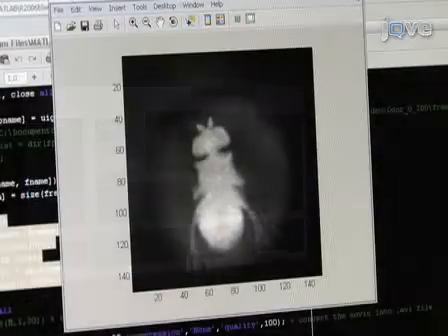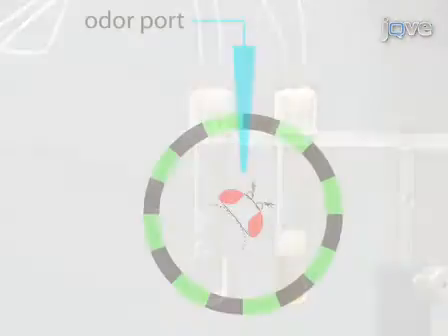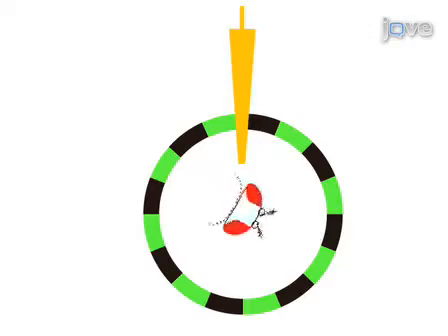Hi, I'm Brian Dijkmars from the laboratory of Dr. Mark Fry in the Department of Physiological Science at the University of California, Los Angeles. Today, we will show you how to acquire and optimize video images for analyzing body angle in an olfactory magnetic tether apparatus. We will also describe 2 experiments to examine the influence of visual cues on odor tracking. We use this procedure in our laboratory to study visual and olfactory mediated flight control in fruit flies. So let's get started.